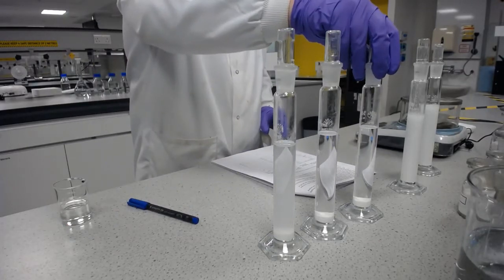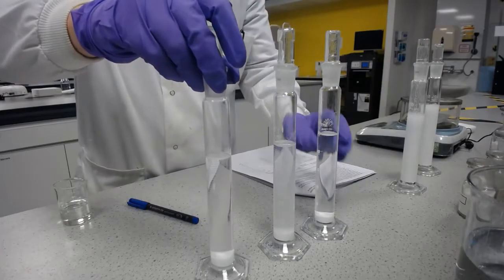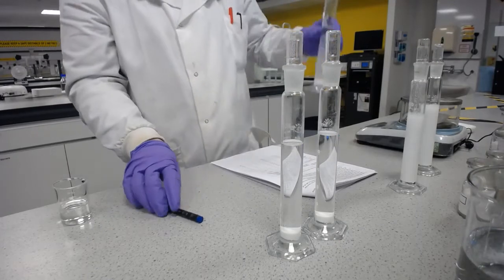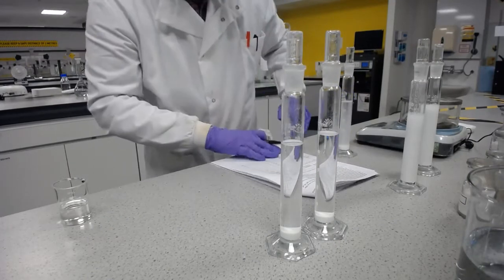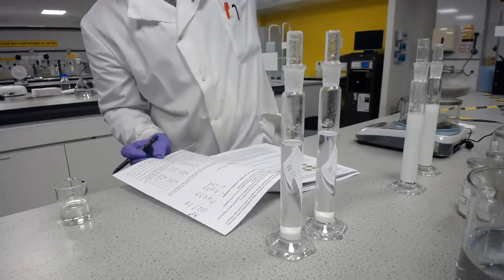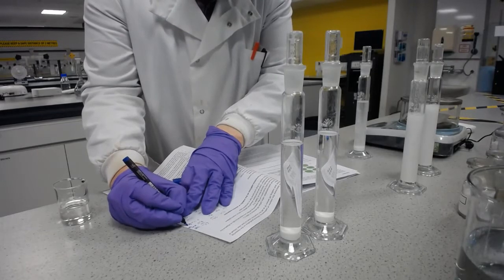And now we've got, oh, these aren't in the right order, the 10 millimolar. So that ended up at a final sedimentation volume of around about 3 mil over 50.